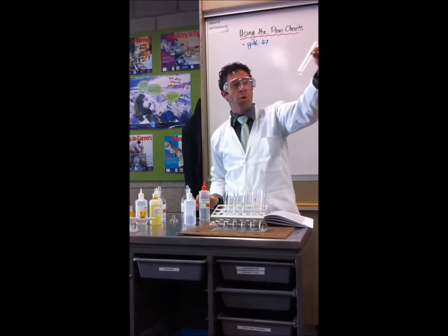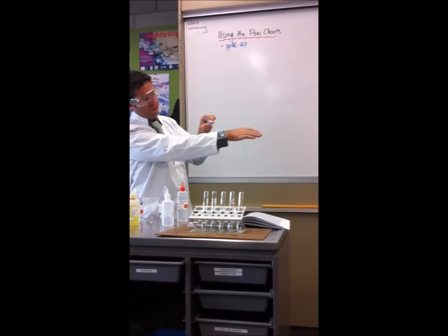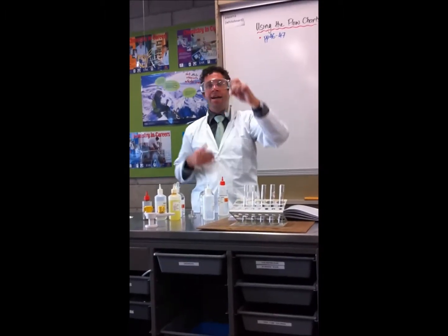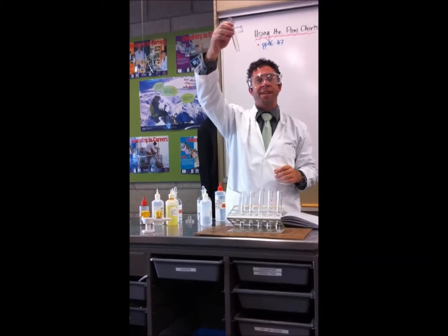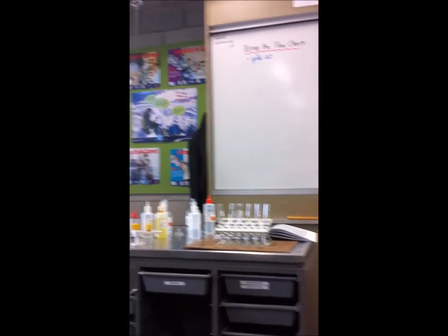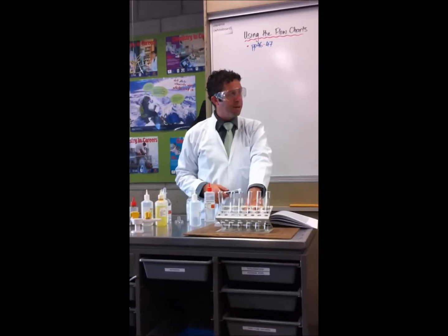And we see that it goes quite cloudy. Okay, can you see that? Probably not there. If I put it in front of my shirt or my hand, you can see it's gone milky. If it goes cloudy, that means it's precipitated. It means that there's a solid in there. The particles are too small for us to see each one, but there is one there. So that means one of those ions has reacted with sodium hydroxide. Well, I'm testing for cations, so it must be the cation.